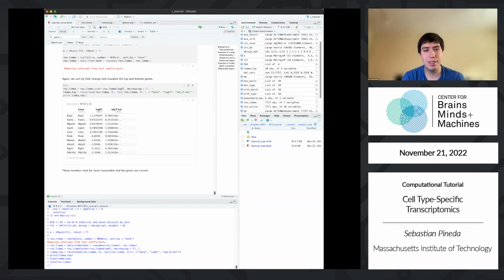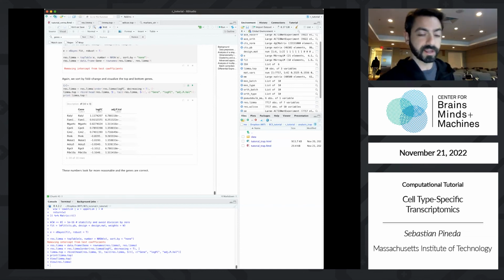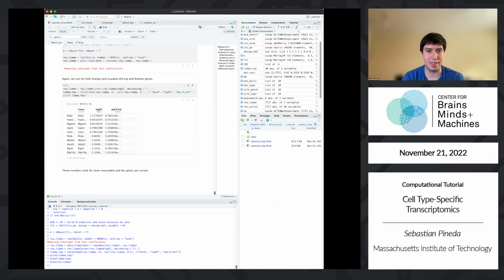Okay. So if there's 2,500 counts for a gene, each of those comes from a unique barcode, which corresponds to one RNA? In theory, yes. If the barcode was not missequenced and didn't change somehow, then yes, they should all be unique.